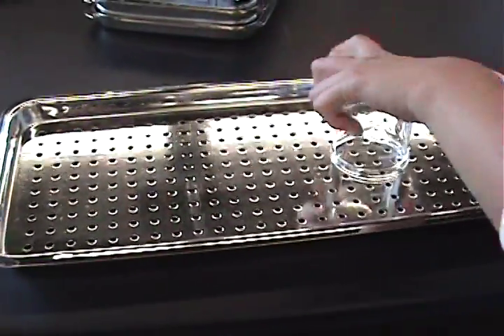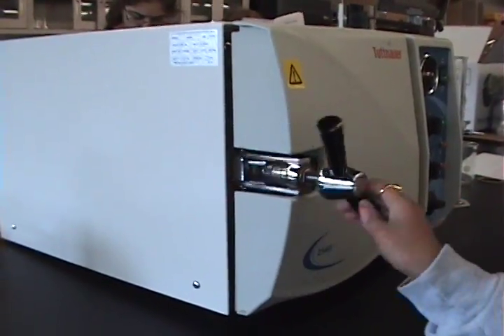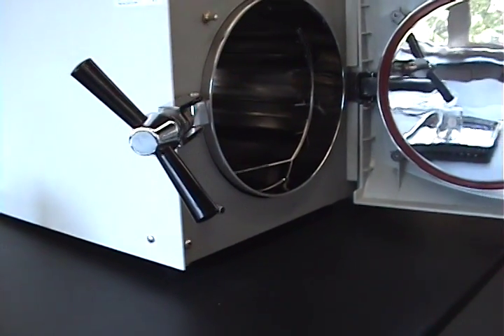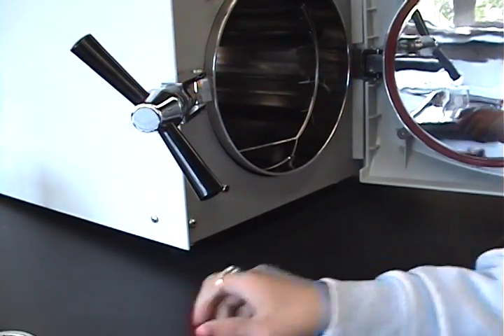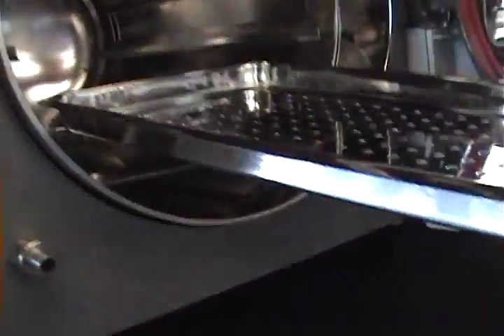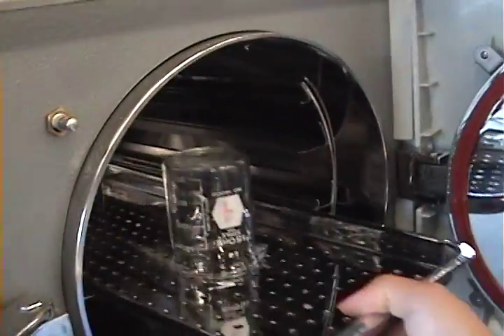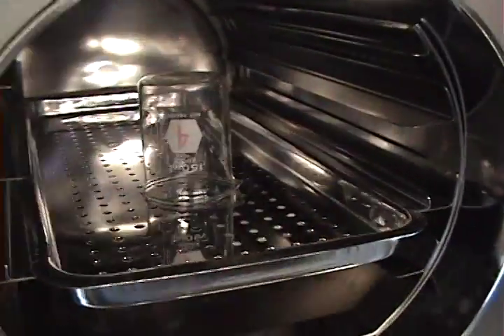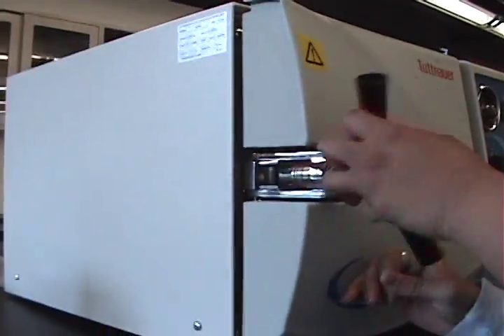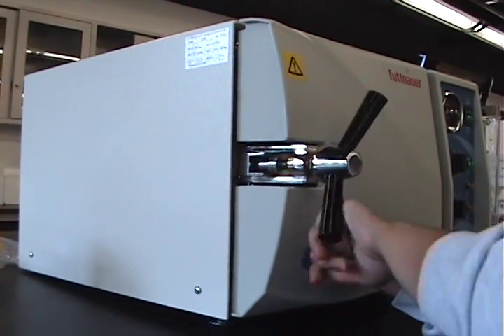Place hollow objects like beakers downward. Open the autoclave to place the tray inside. Take the tray and place it in one of the slots. Close the door, taking the knob and tightening it — make sure that it is fully tight.